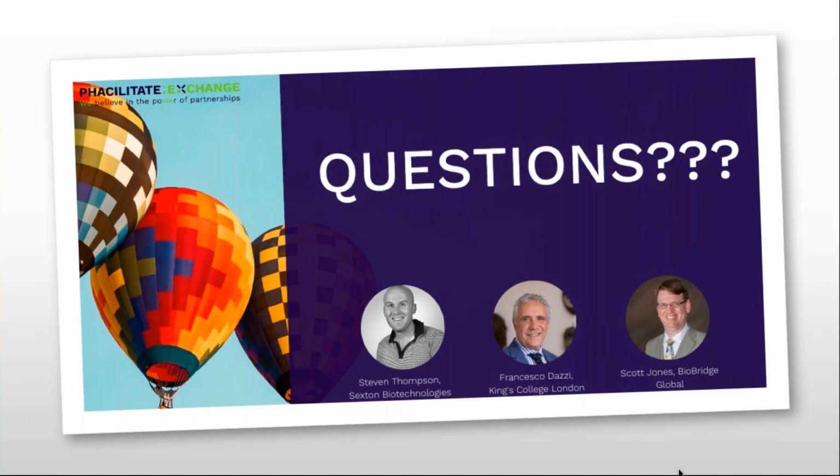Thank you. Stephen, do you have any thoughts on this, or is it all being covered? So I think that's largely covered it. There has been some discussion around standardization of HPL, and some good publications on that. But obviously everybody has different performance needs, and sometimes it's difficult to standardize the whole industry. I think what we need to get to is standardization of the required process validations for individual products that go into a manufacturing process, that reduce that variability. I think that is the way we can start to address some of the challenges of variability that we see. Yeah, I concur.